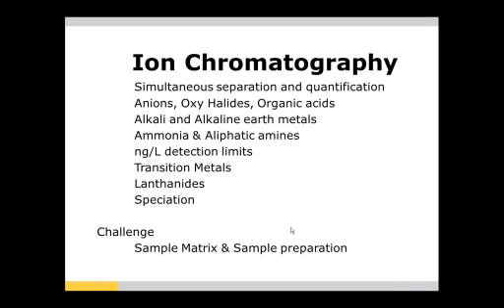But the key point is that the challenge remains with the sample matrix and the associated sample preparation. How do we integrate the needed sample preparation into the already developed ion chromatography technique?